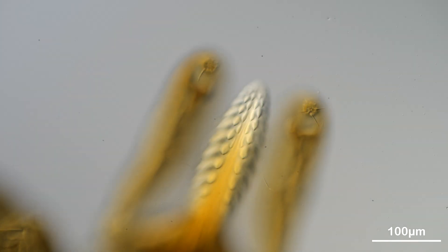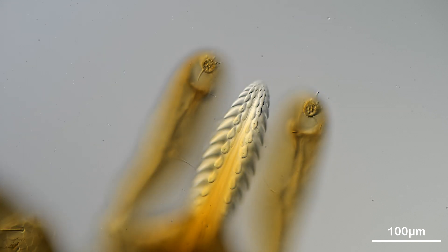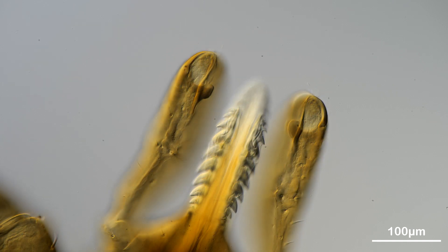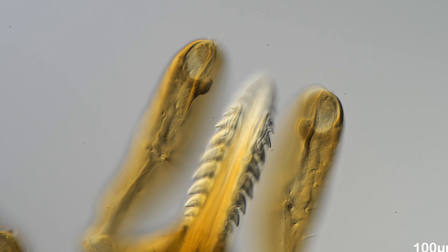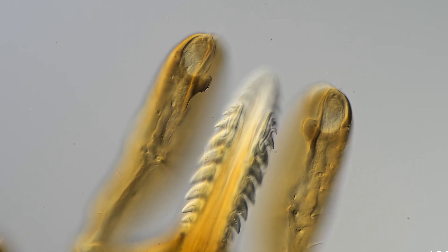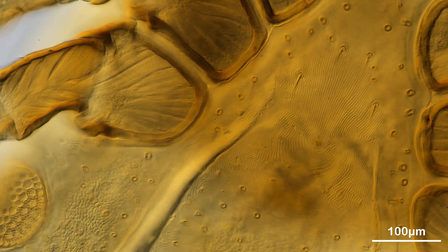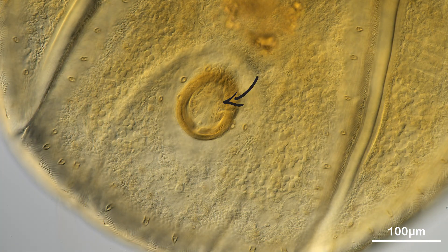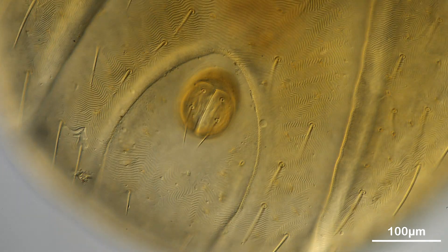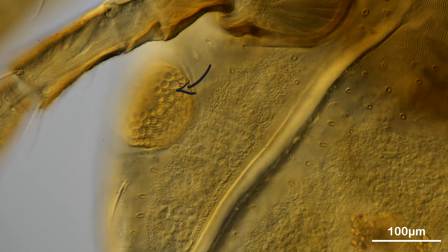As we've already observed in the previous shot, we've transitioned to differential interference contrast microscopy and switched to a 20x objective lens. Once again our focus is on the hypostome, but I'm eager to introduce you to another feature situated just below it — the chelicera. These structures become apparent as we fine-tune our focus and they play a pivotal role in the tick's ability to penetrate our skin. Unlike the relatively immobile hypostome, the chelicera are movable; they employ their sharp edge to cut through the skin, facilitating the tick's digging process. Looking at the rest of the tick, we immediately notice the furrowed and hairy surface of the body. What is extremely cool is that we can even see the muscle fibers inside the tick's legs. At the bottom we have the anus, which is located inside an anal groove — this can be an important feature to differentiate different tick species. Lastly, we have the spiracle on the left and right side of the body, which is the opening to the tracheal system and allows the tick to breathe.